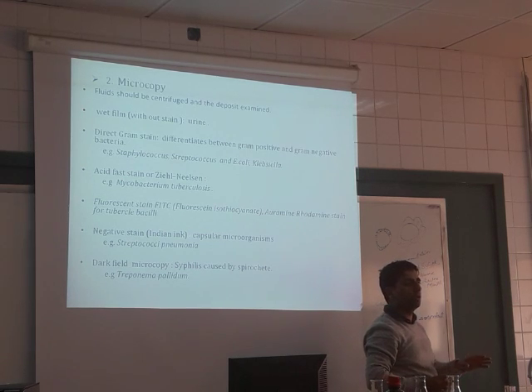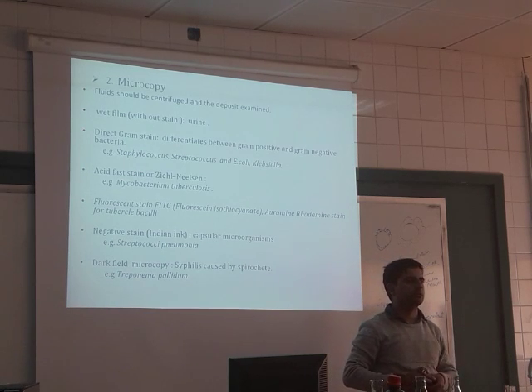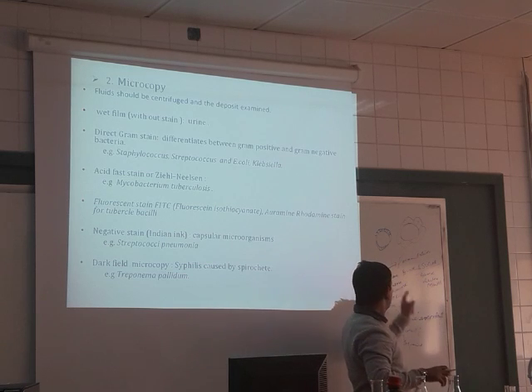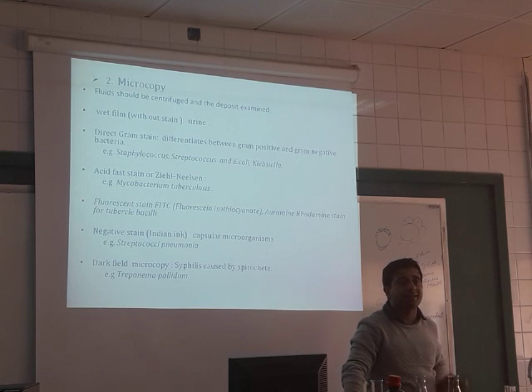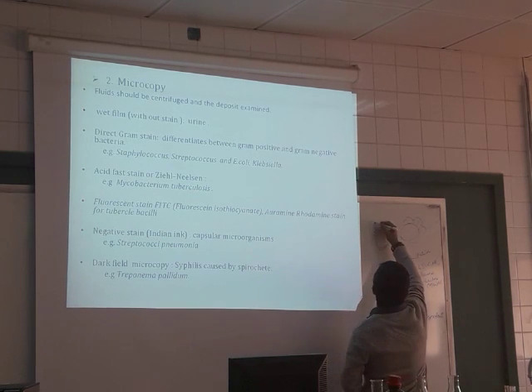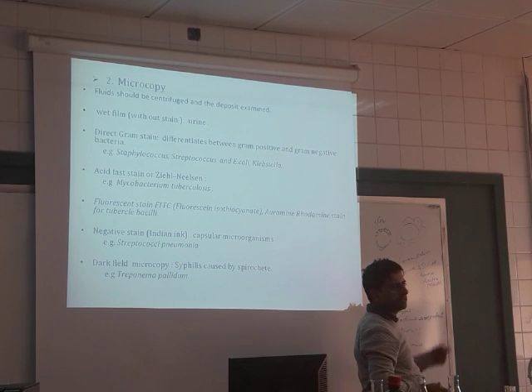First you should know what is the gram positive and gram negative bacteria cell wall. Then you can talk about the staining. In gram positive bacteria, the main thing that absorbs the crystal violet stain is peptidoglycan. It's thick. And there is also the presence of teichoic acid in gram positive. But when we talk about the staining of crystal violet, peptidoglycan takes up the stain.